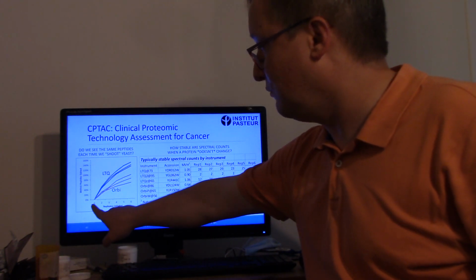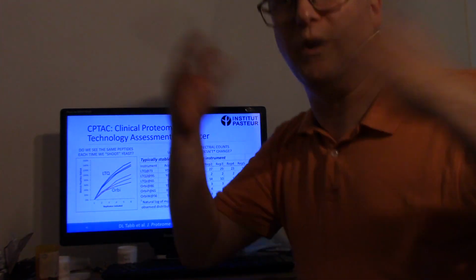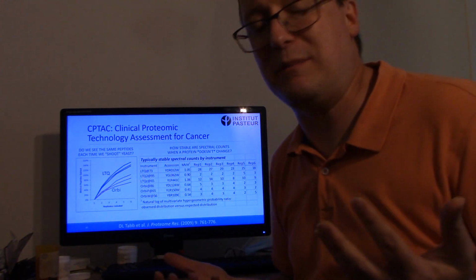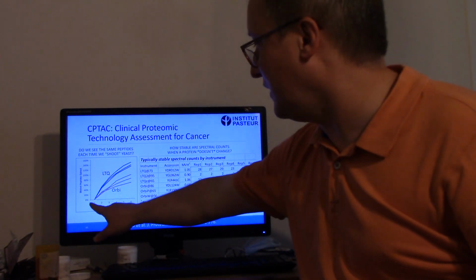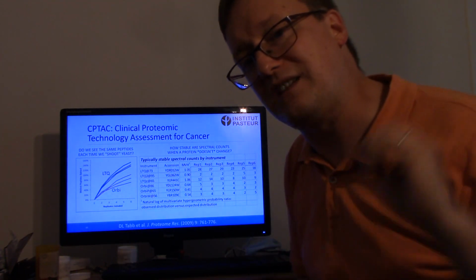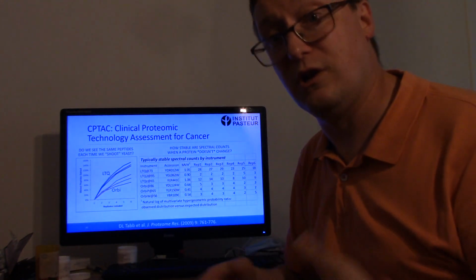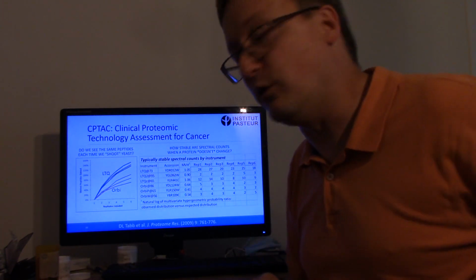In the first case, we see that in the first shot of yeast, we have essentially 100% of the peptides seen in one run. Then when we run a second or a third or a fourth or a fifth or a sixth replicate, we ask how much the number of peptides observed changed as we gained these second, third, and fourth experiments.